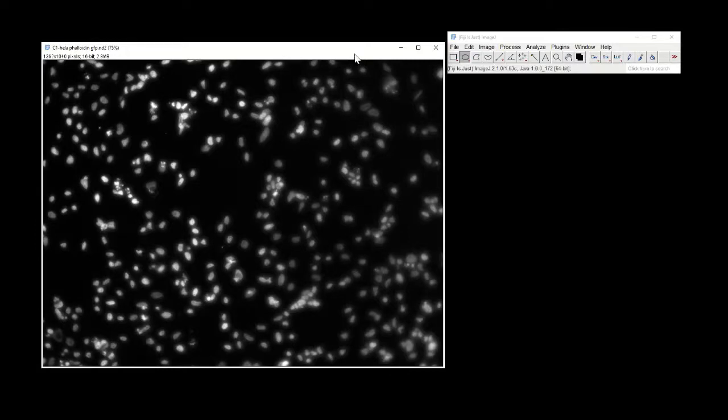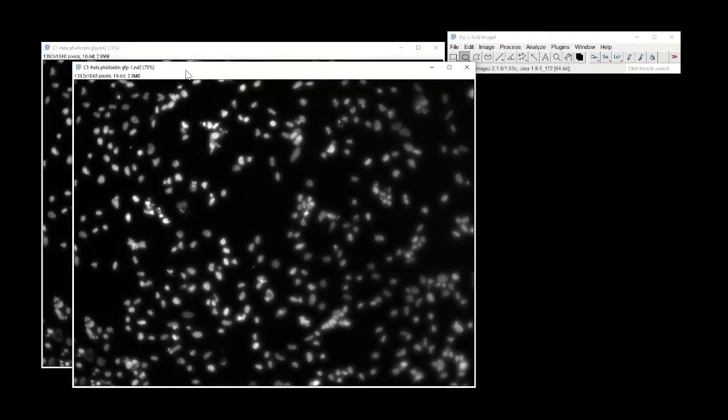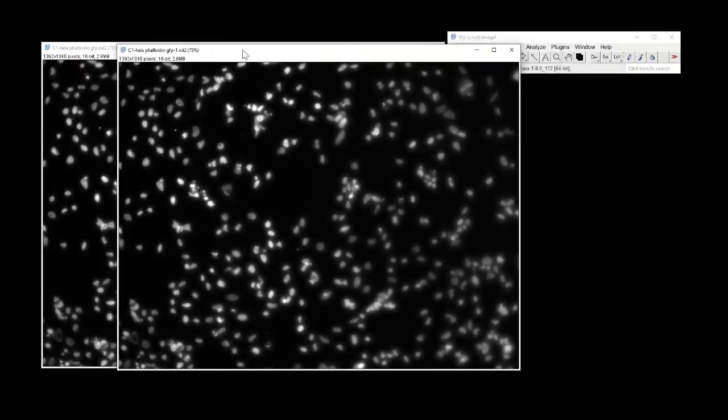But if you duplicate it, you don't need to go through the exercise of splitting your image every single time. So to duplicate the image, we're going to click on Ctrl-Shift-D. And that's going to bring up this window, which essentially asks you how you want to label your duplicate. So we're just going to click on OK, and this is going to be our duplicate. So you see now you have 2 of them.